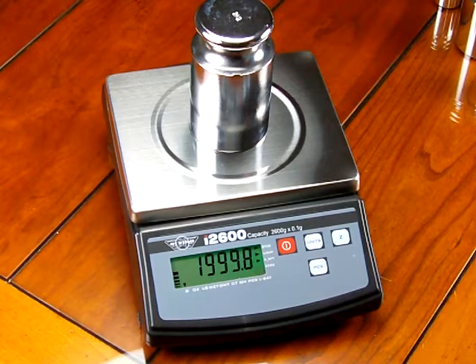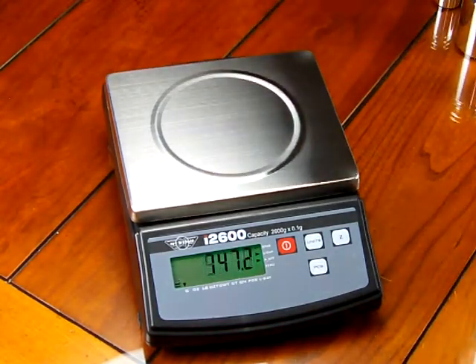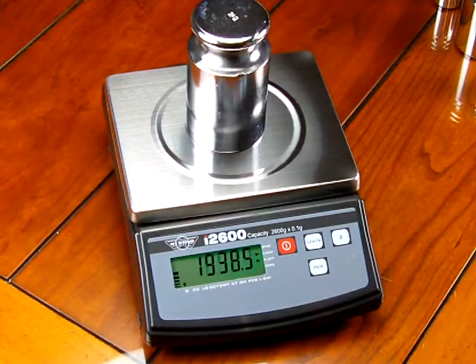Now we can put our 2000 gram weight right on the scale. The scale reads plus or minus a tenth of a gram. Just zero the scale out, put the weight on, and give it a minute.